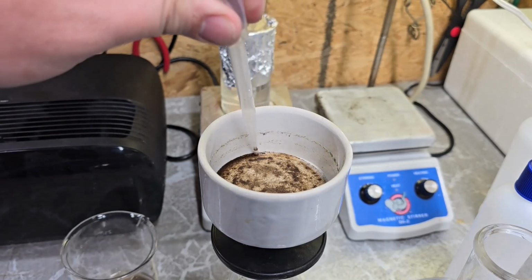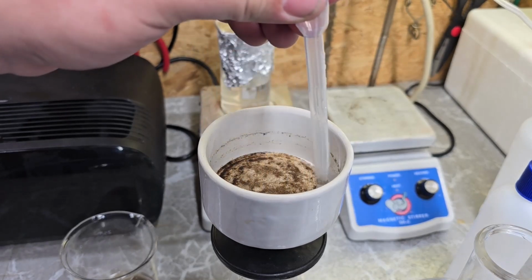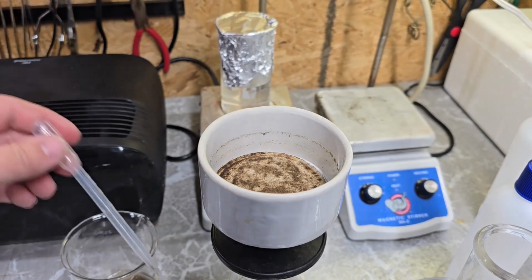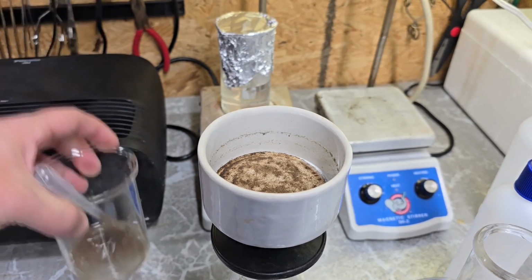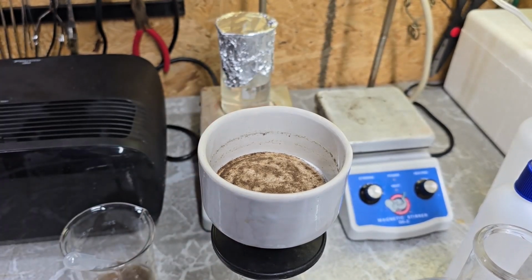I mostly want to make sure that I get as much water out of here as possible, so whenever I do turn the vacuum off, it doesn't suck any of this stuff, or let any of this stuff go underneath the paper down into the water down here, because this will have our concentration of little critters in it, as will the top of the filter paper. That actually looks pretty good.